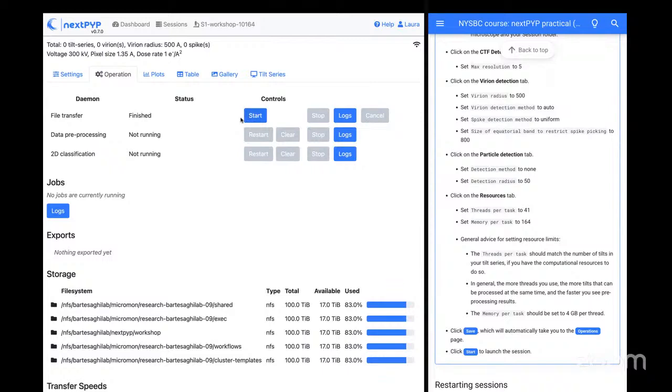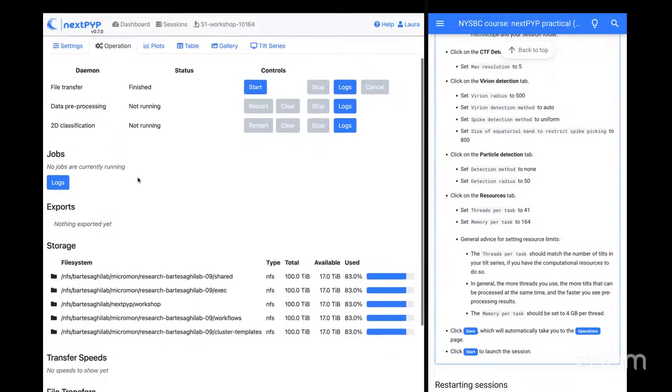When I click start, obviously the status will change to running. When it's done running, you'll see the next one will start, saying running. They don't ever say done unless you kill the job. I guess it's just something to watch out for.